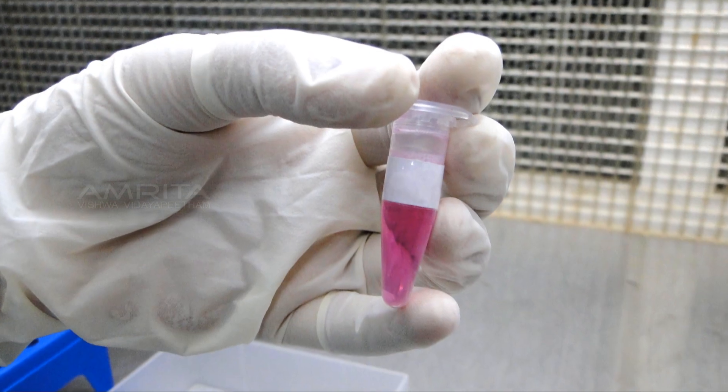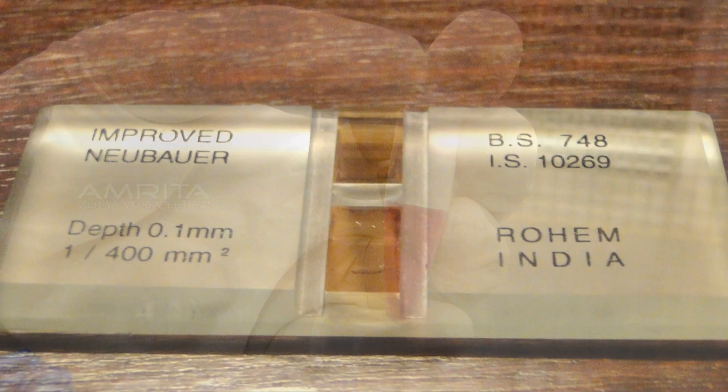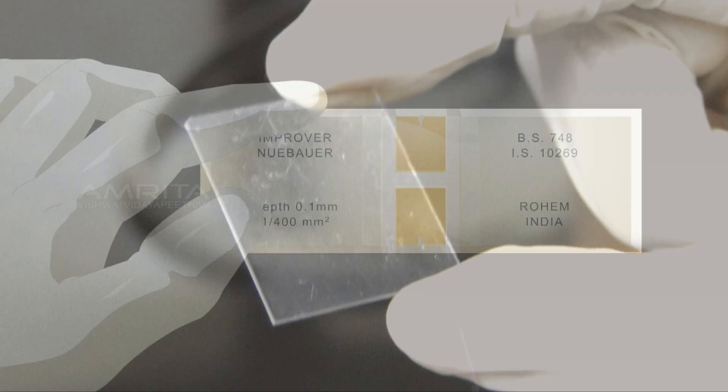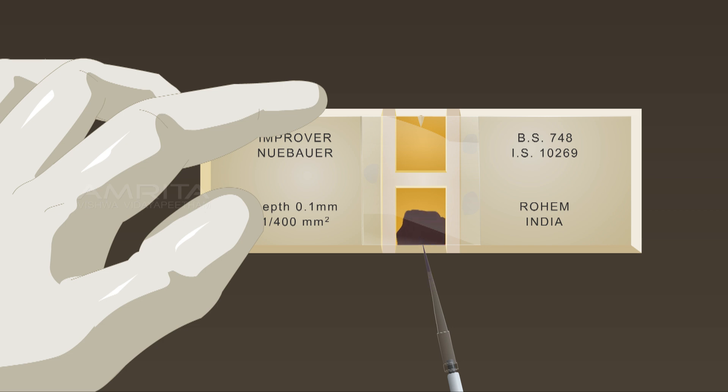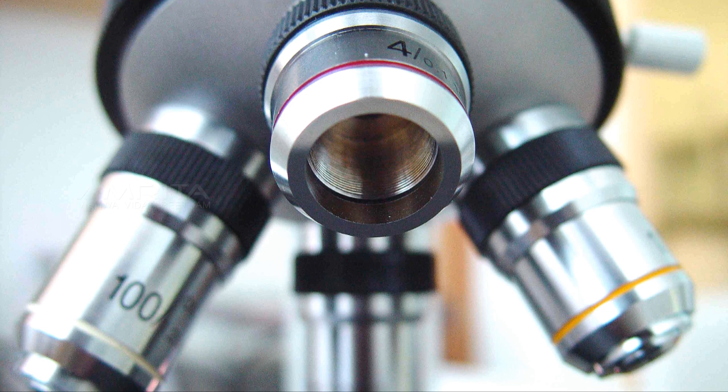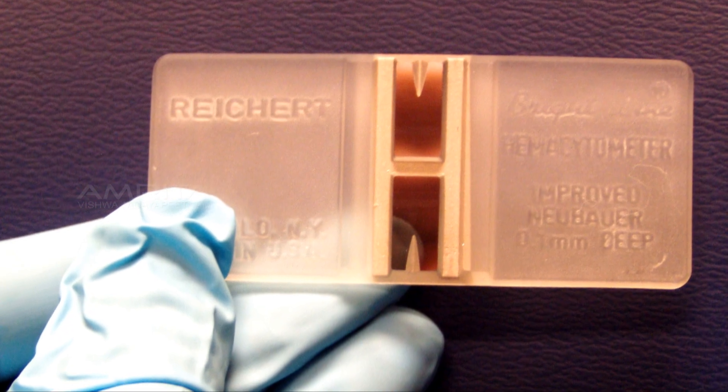A liquid sample containing immobilized cells when placed on the chamber and covered with cover glass, capillary action completely fills the chamber with the sample. Looking at the chamber through a microscope, the number of cells can be determined by counting.